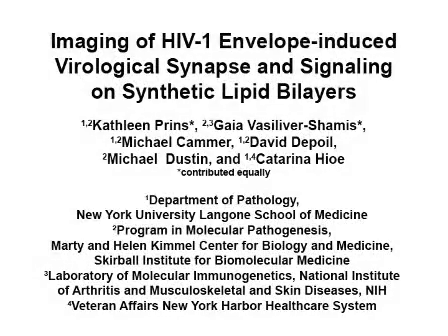This method creates lipid bilayers that mimic an infected cell surface in order to study the HIV virological synapse formed with primary human CD4 T cells.